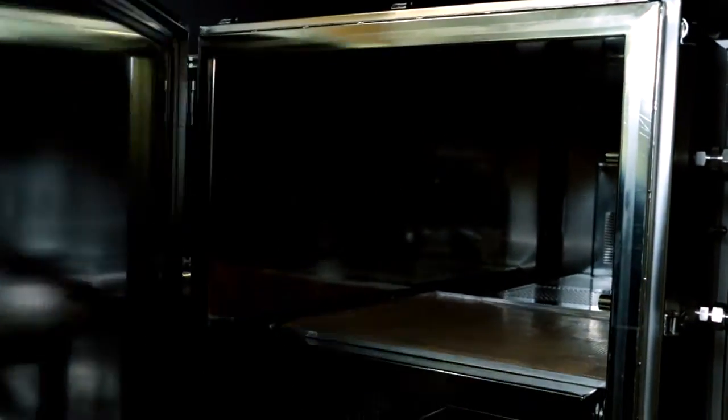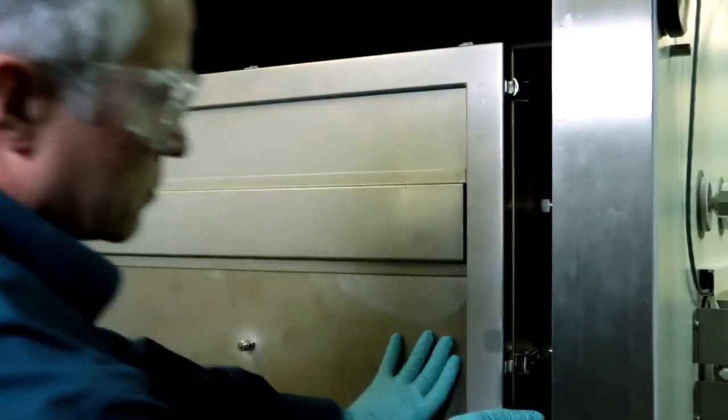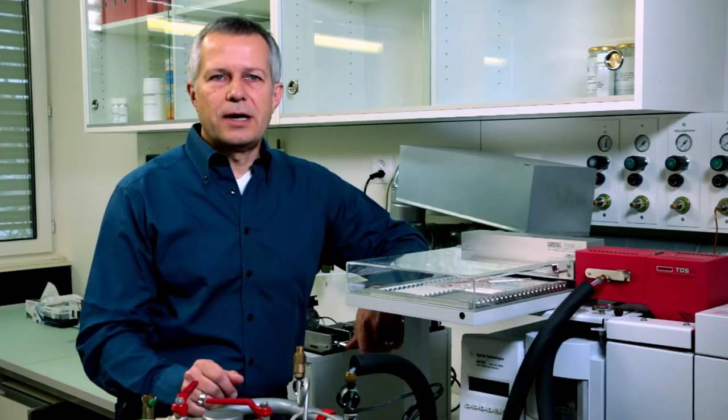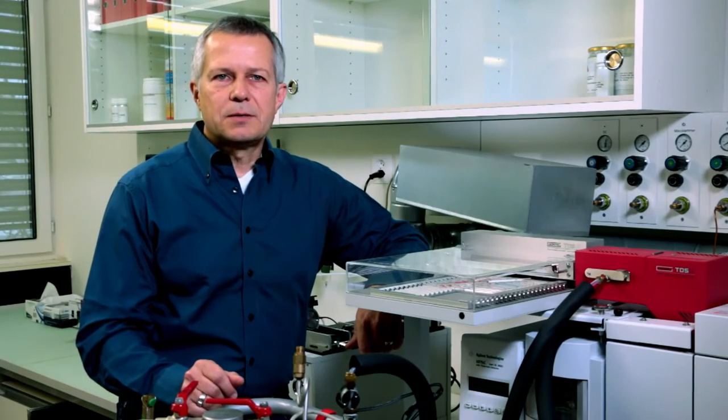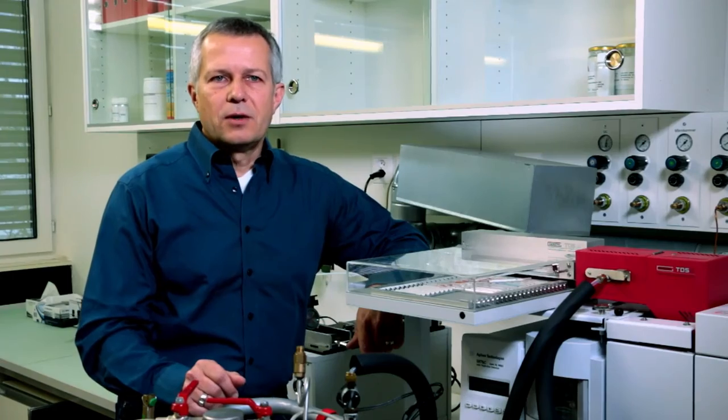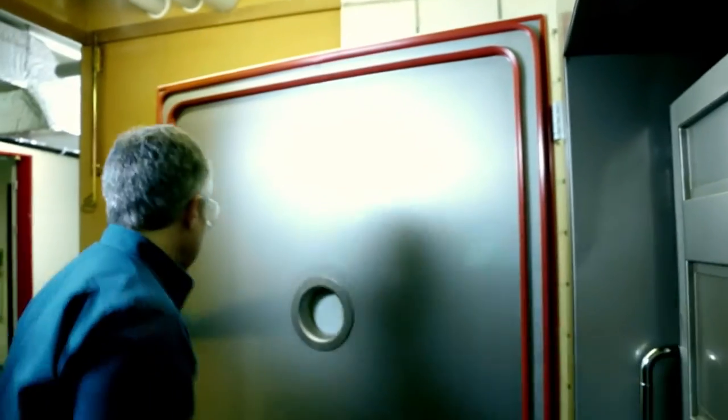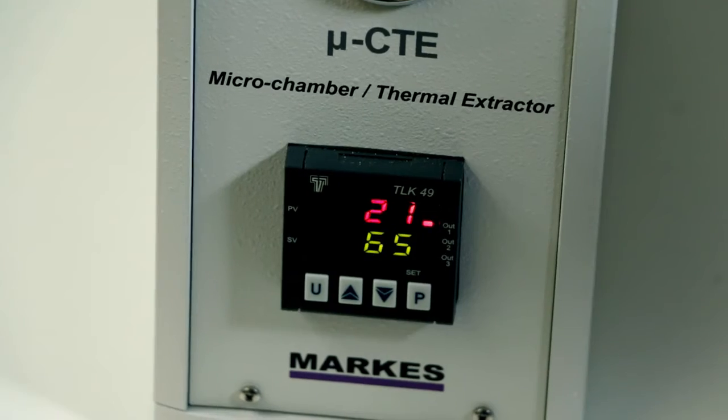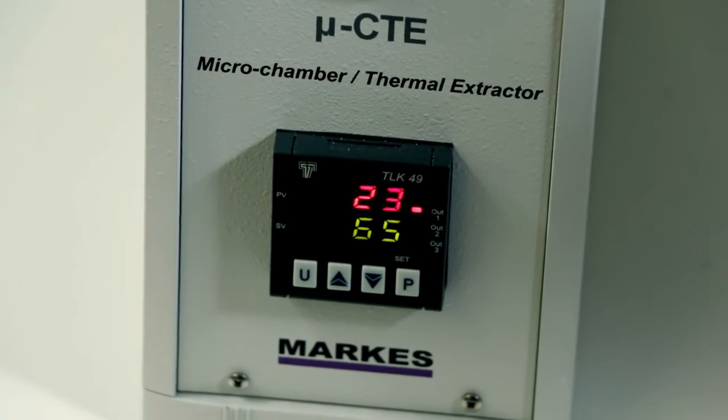We have two testing devices with which we can cover most analytical methods. The big emission test chamber serves for indoor air measurements. The sample is placed in the big steel chamber which is one cubic meter in size. The chamber is supposed to simulate a sealed room. The temperature, humidity, and air exchange rate are precisely regulated.